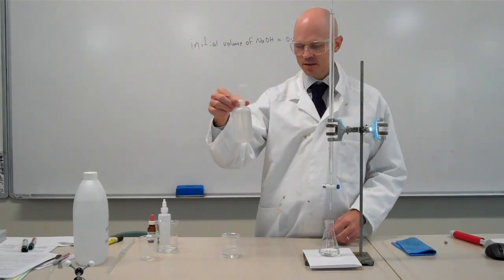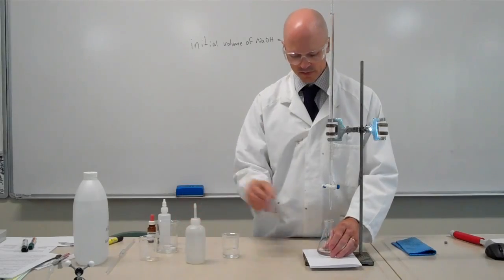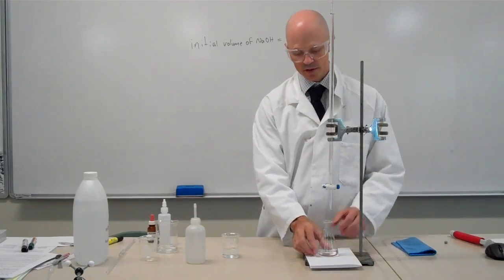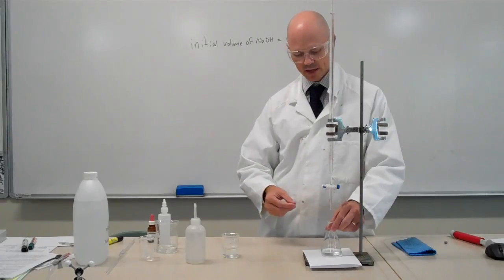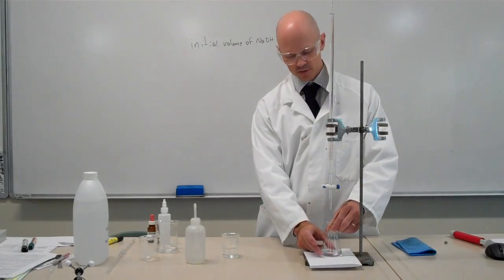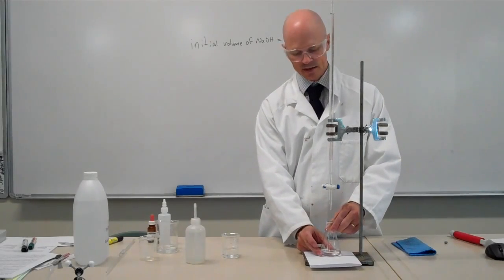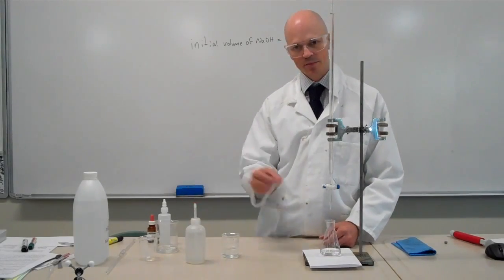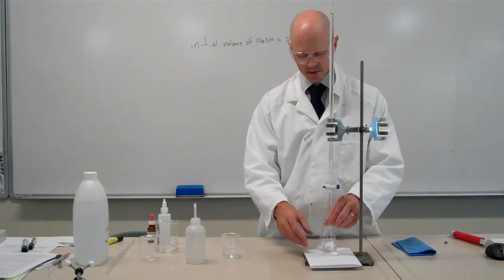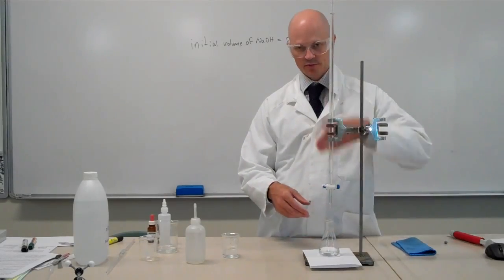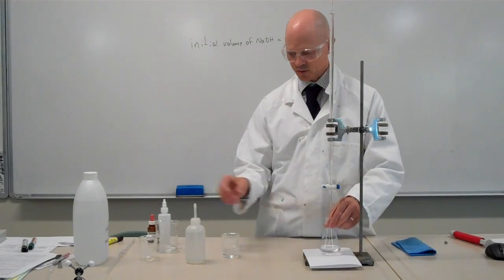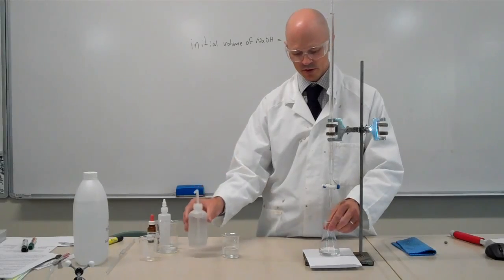I can do that, even though I'm changing the concentration of the acetic acid in here by adding extra water, I'm not actually changing the number of moles of acetic acid added. Now I know that I added 10 ml of the acid and I can calculate the number of moles through this whole process. So it's quite okay to add extra water to your conical flask.